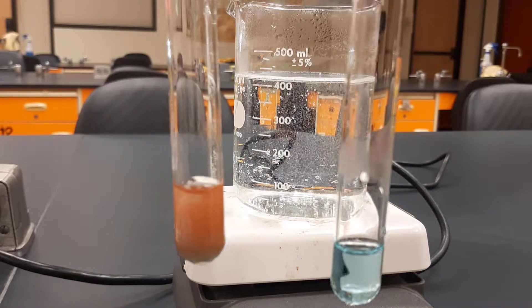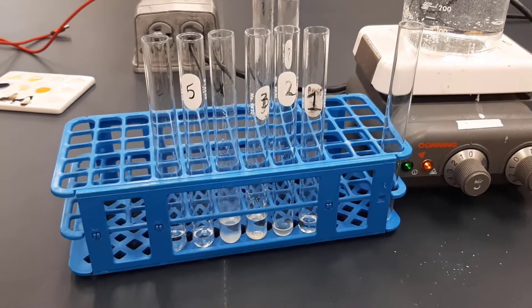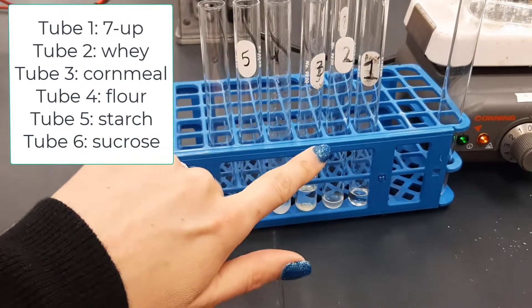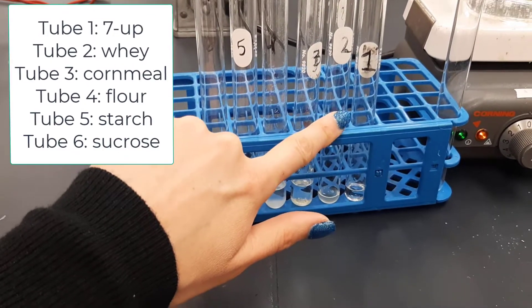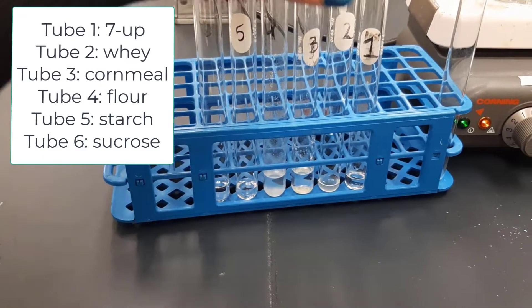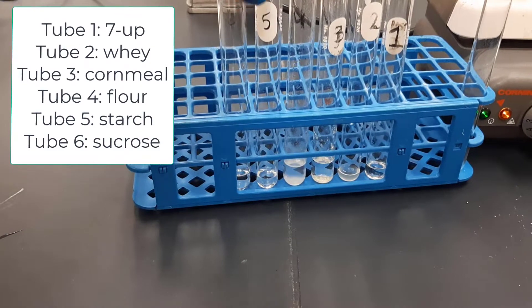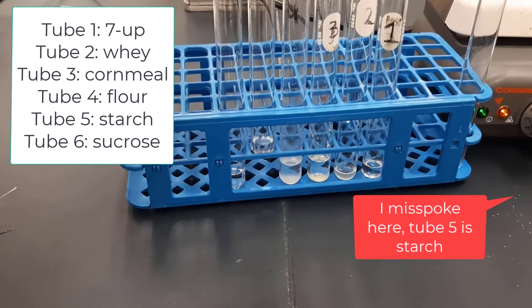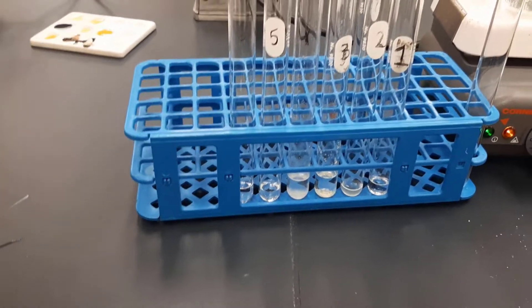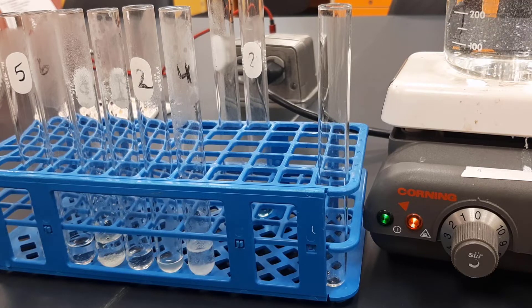Now I've set up some other solutions to test for reducing sugar. Number one is Seven Up. Number two is whey. Number three is cornmeal solution. Number four is a flour solution. Tube five is sucrose, and tube six is a starch solution. Let's add our Benedict's solution and see which ones turn color.